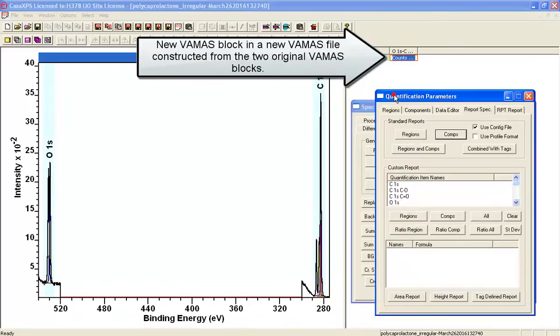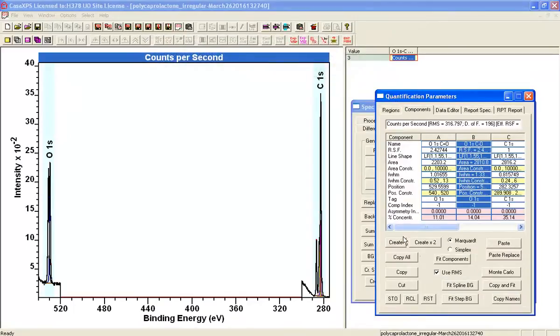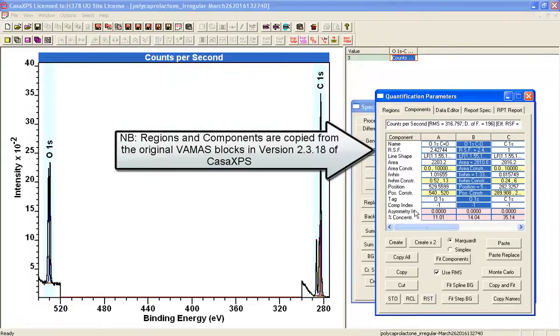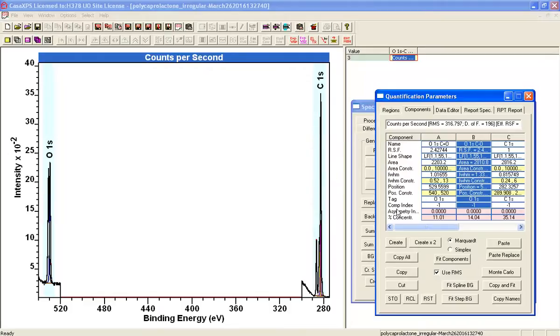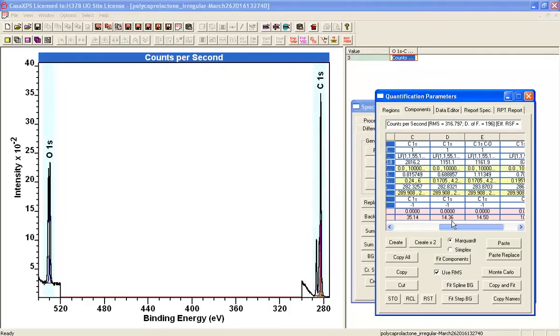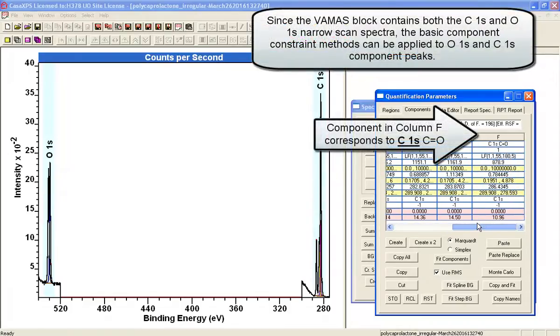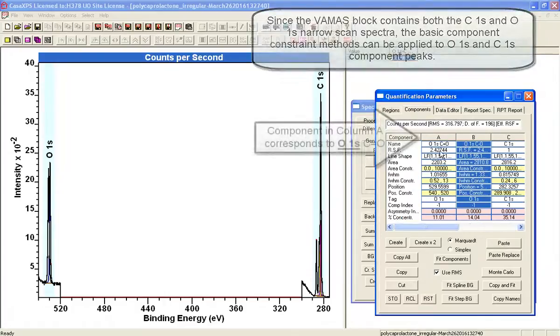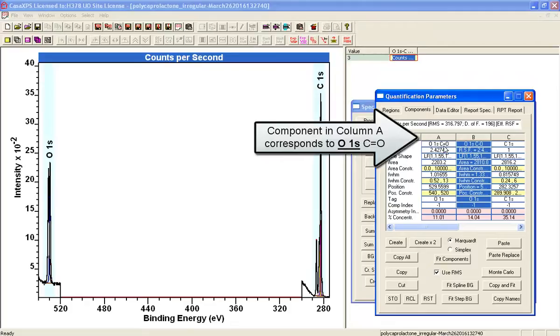Now when I look at the components property page I've got all of these components that I previously set up and I can now test the relationships quite nicely. In column F I've got C1S C double bond O and in column A I have the oxygen corresponding to that.